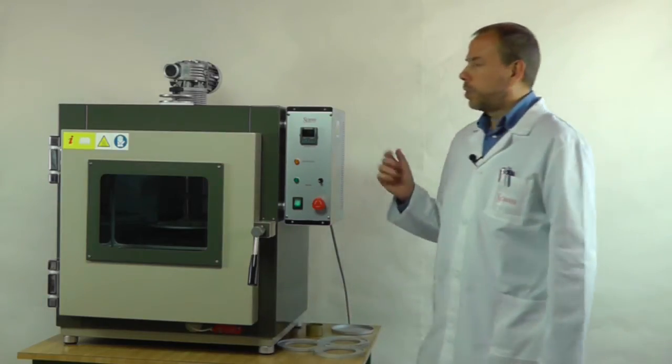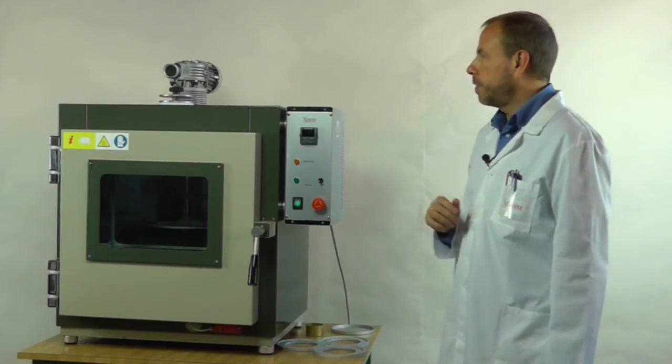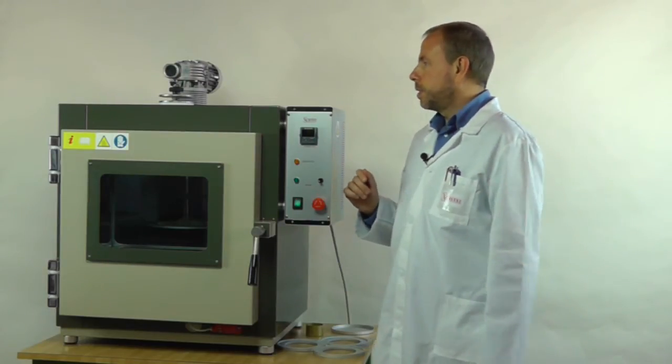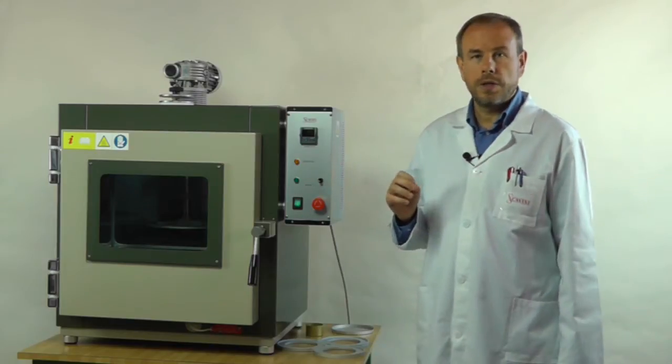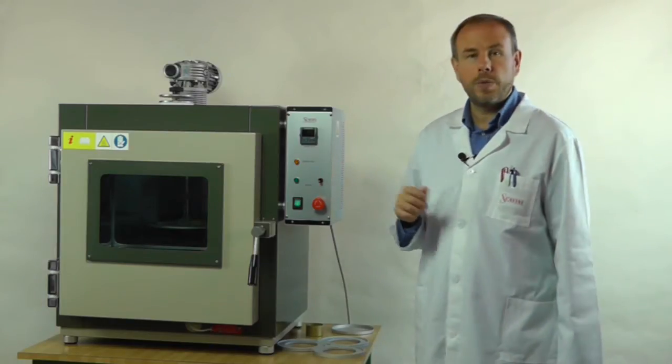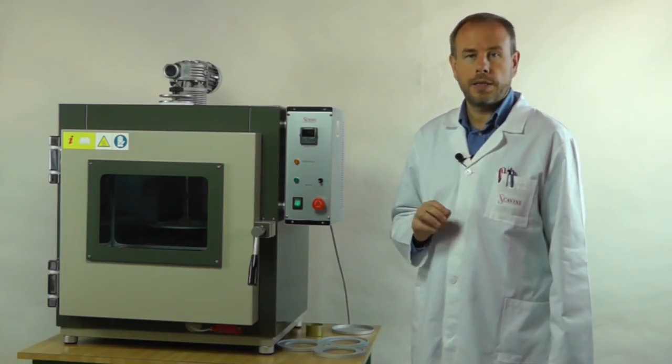Let's take a look at the equipment. As you can see, the oven looks very solid and robust. The outside is powder coated, while for the inside we use only top quality stainless steel.